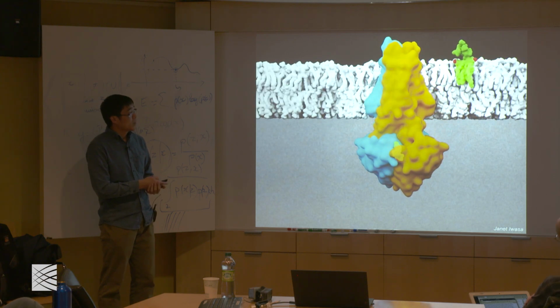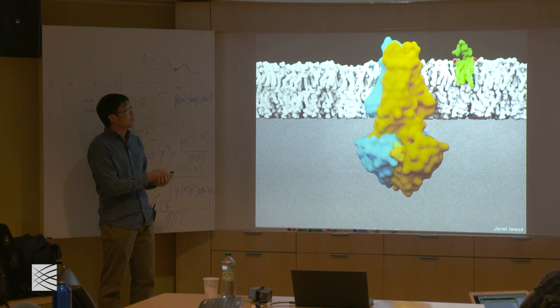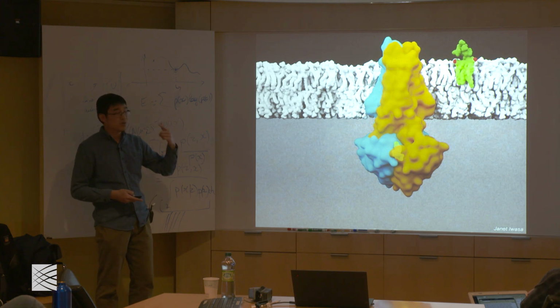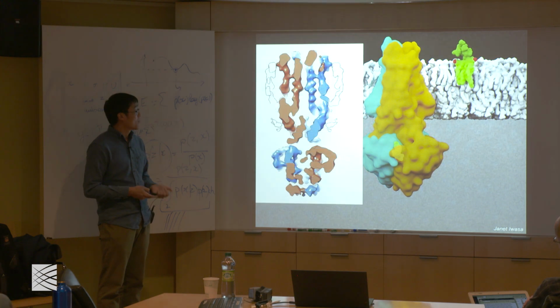One detail here is that originally this lipid acyl chain is pointing up. When the transmembrane domain is opened up and directly exposed to the aqueous phase, that generates a very unfavorable environment for the lipid acyl chain. So we suspect this type of rotation at this step probably happens spontaneously. After LPS is released, the transmembrane domain will collapse and form a helix bundle. That would be the structure we solved here.